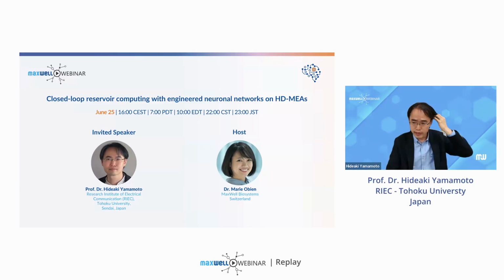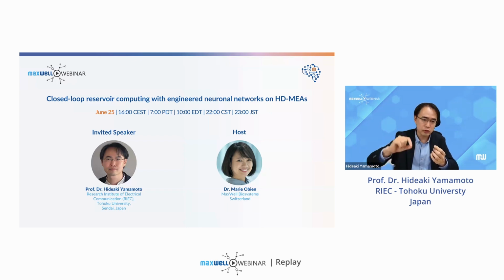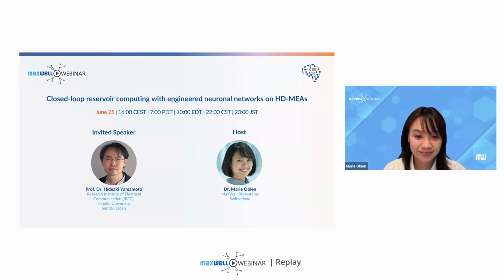So that's a very good point that I skipped. The input is basically a biphasic pulse that people typically use in these MEA experiments. And what we did was to map the amplitude of the sinusoidal wave to the amplitude of the biphasic pulse that gets applied. And you applied it on all the modules.